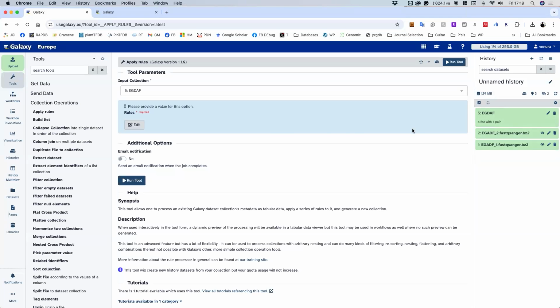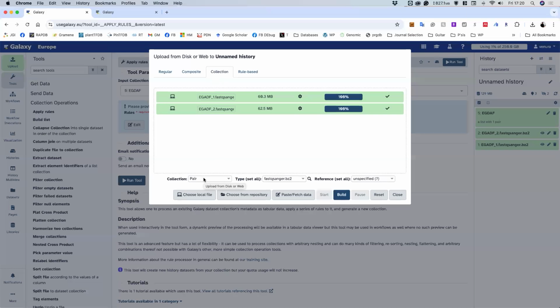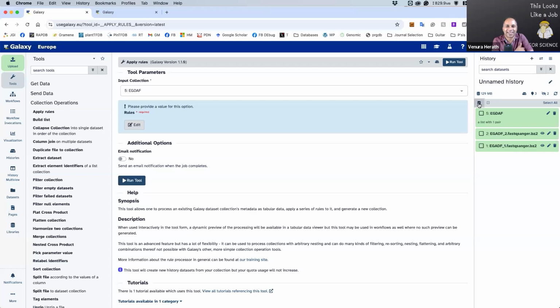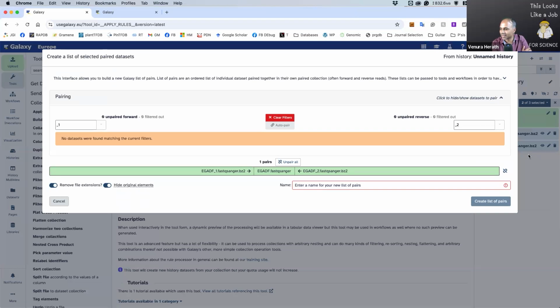How can we get tool parameters? So I think you're asking about this, right? No, sir. Okay, I will show you what I did and then let me know. I think you're talking about this, right? This window, or what tool are you specifically focusing on? Yes, sir, that one. Okay, no problem.